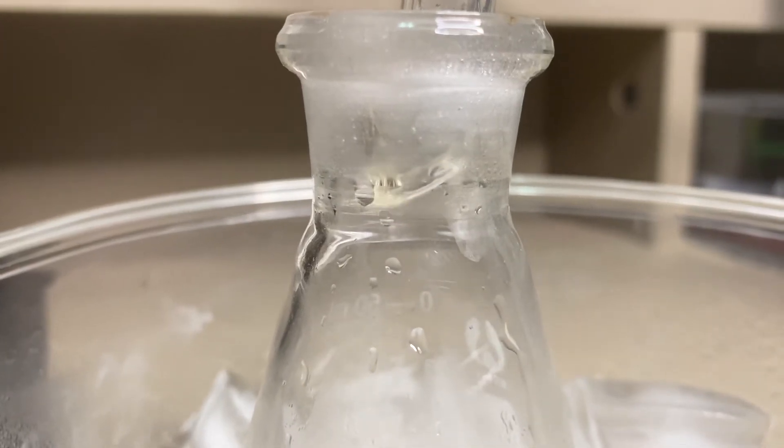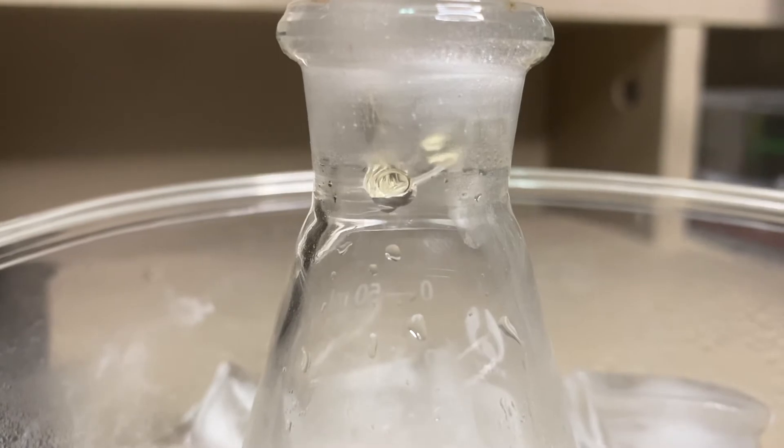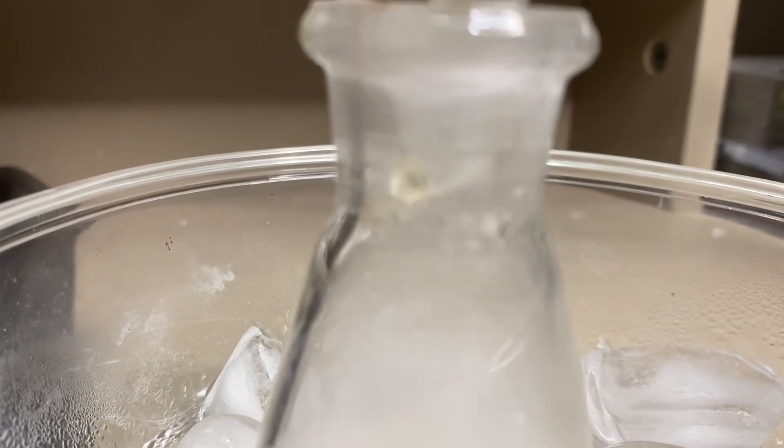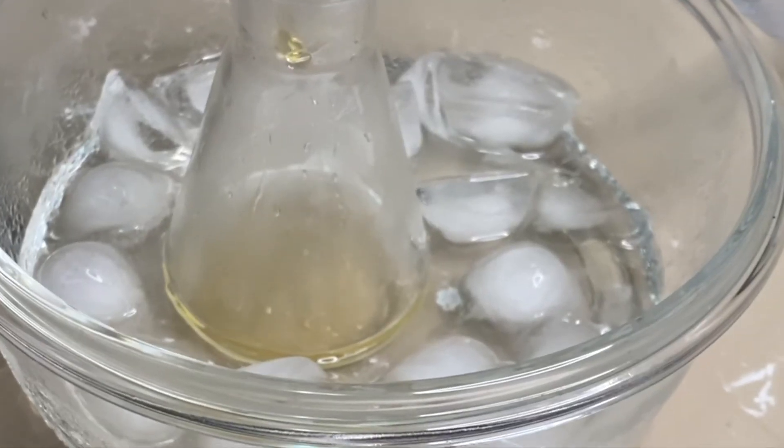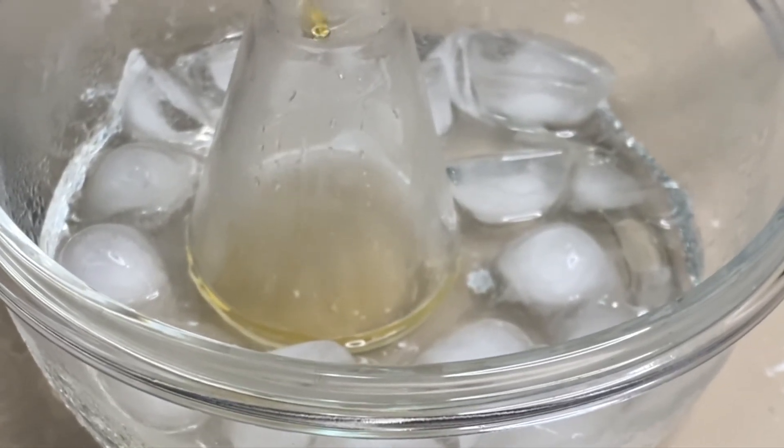After a while, some clear distillate was collected. It was quite clear at first, but as the reaction progresses, the distillate starts to take on a slight yellow-brown color due to the formation of some impurities.